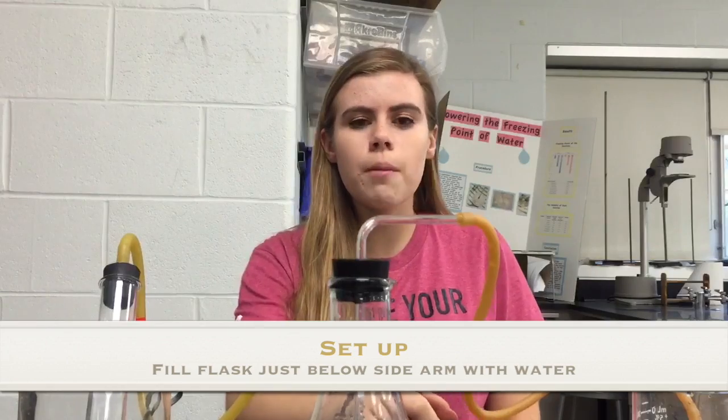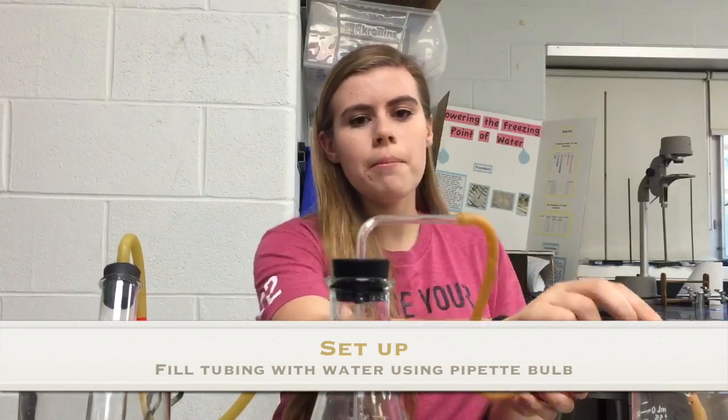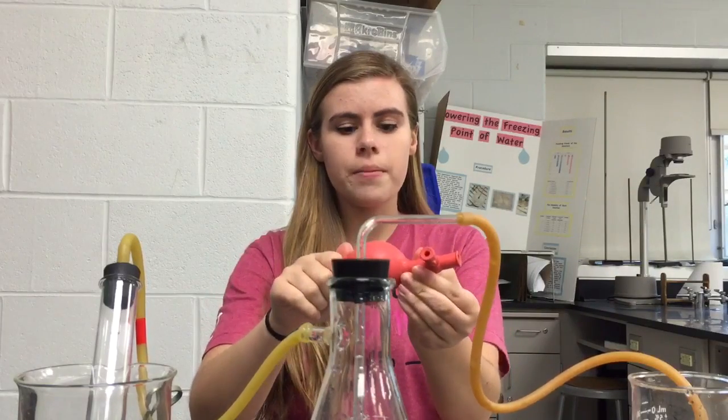To fill the tubing up with water, attach the pipette bulb onto the end. To use a pipette bulb, press down and squeeze. To release, press down and pull out. A helpful tip is to put the pinch clamp onto the tubing before attaching the tubing to the sidearm flask.